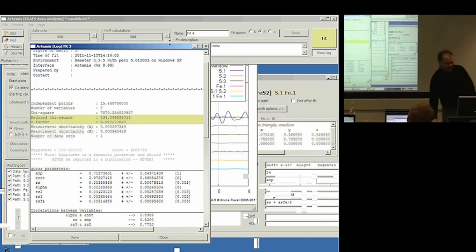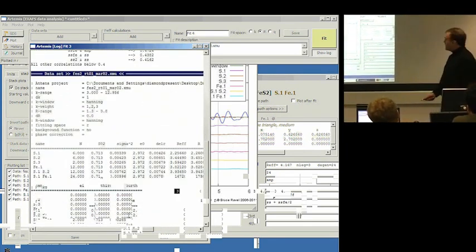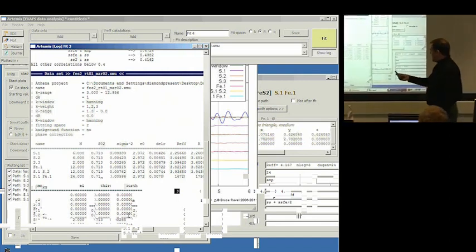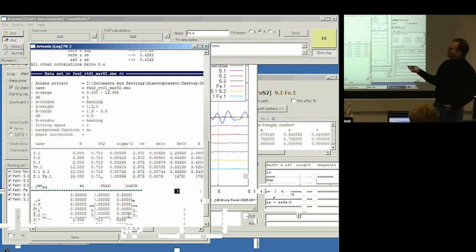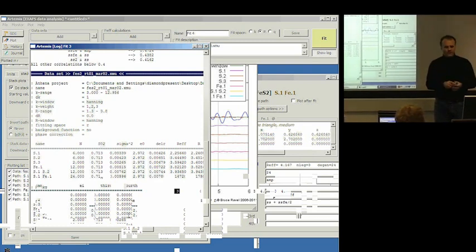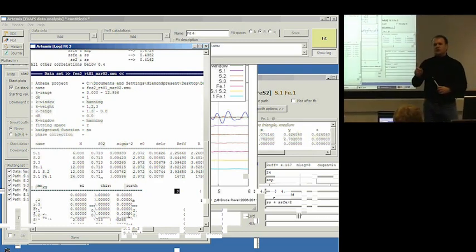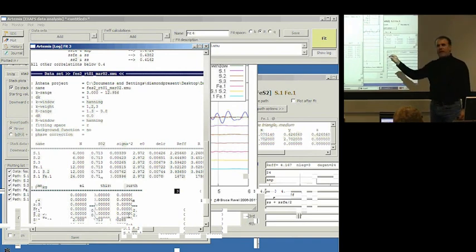This is still problematic. But everything came out sort of reasonably. If we look down and see how all of our math expressions panned out, we see that we still have reasonable values for the sigma squares for these paths. But we need to think again about these approximations that we made. We made this one and the other one that were hand-wavy approximations. I will assert, but leave as an exercise for all of you to try out when you start doing some fits, that it is better to include the multiple scattering paths somehow than it is to not include them. I think we already saw that.